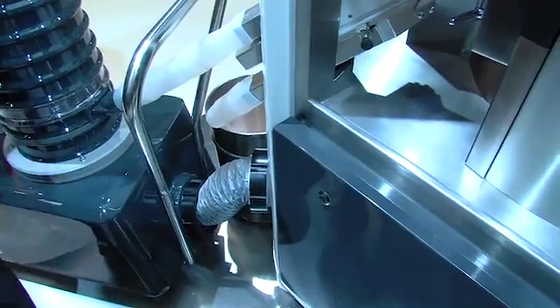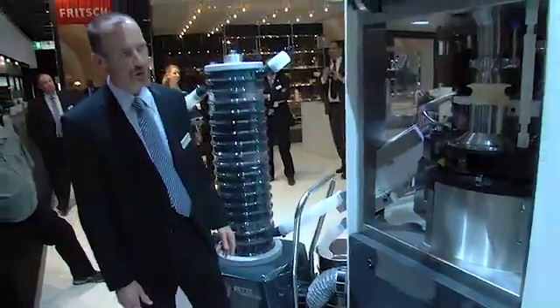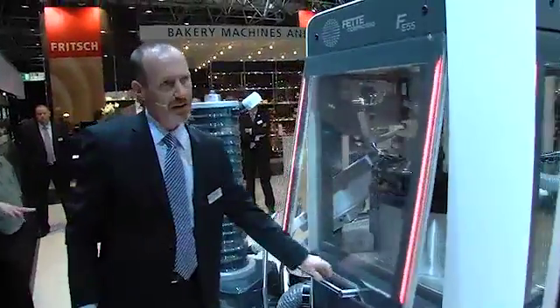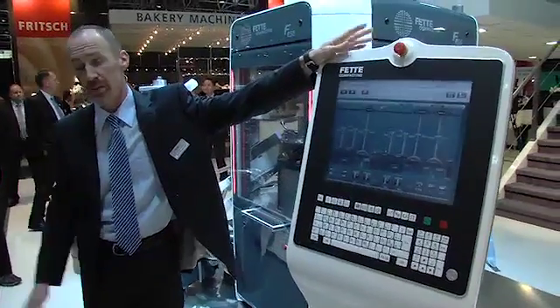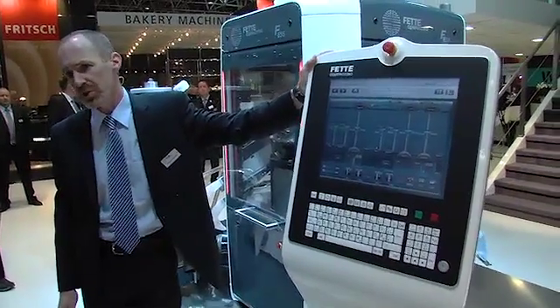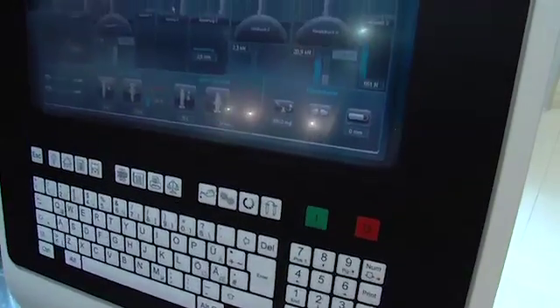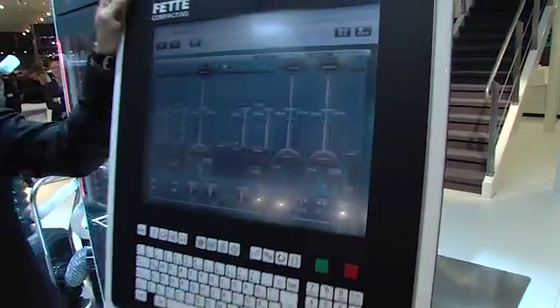The item most notable and worth mentioning is the fact that there is nothing on the floor — no cables, no hoses to trip over, no accumulation of product to clean behind. And finally, tying all of these efficiency features together and closing out the Tri-Easy concept, is a completely redesigned human-machine interface panel. As you can see, extremely ergonomic, no crevices, no flat surfaces for dust to accumulate on, 19-inch touchscreen, very easily accessible and easy to manipulate with a completely redesigned visual software platform.